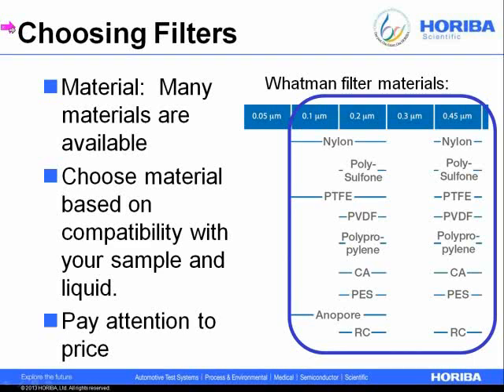Now, what about choosing filters? There are a lot of different materials available. So this is a little sketch from Whatman. They have nylon, polysulfone, Teflon, PVDF, polypropylene, Anopore, PES, CA, RC. And you can read the application guides to see which materials will work for your application.